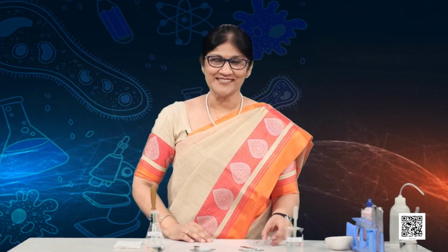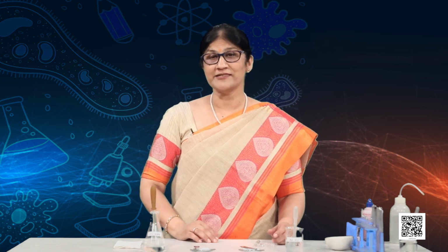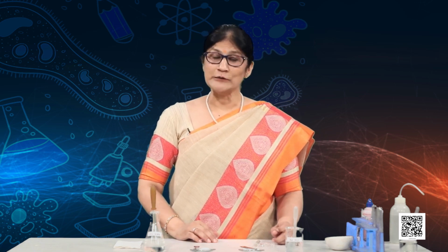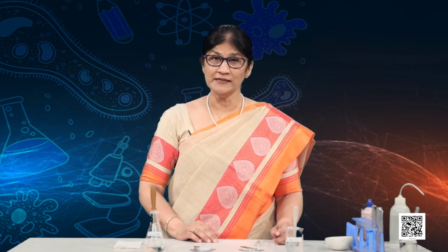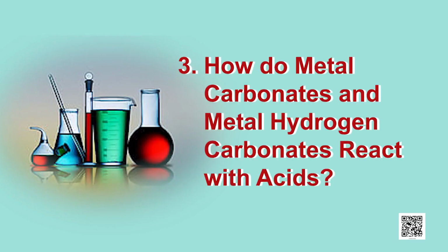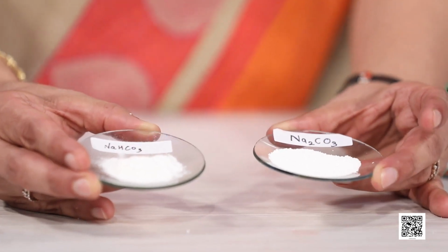So, young scientists, we have learned how acids and bases react with each other. We have also seen the reaction of acids and bases with zinc metal. Now, let us see how metal carbonates and metal hydrogen carbonates react with acids. So, I have some sodium carbonate and sodium hydrogen carbonate with me, and we will see the reaction of these.